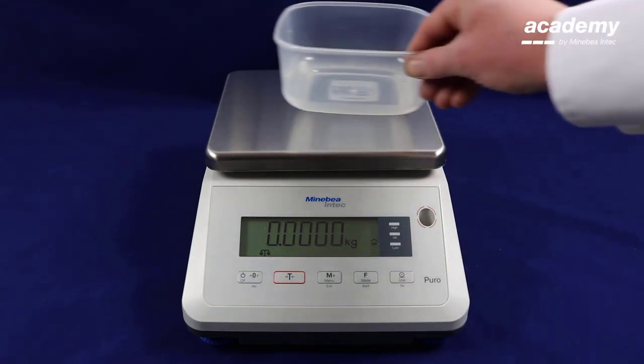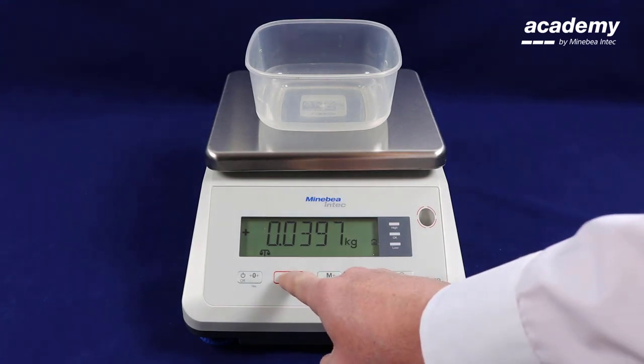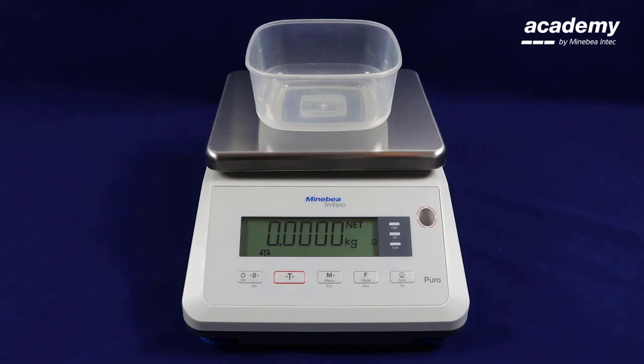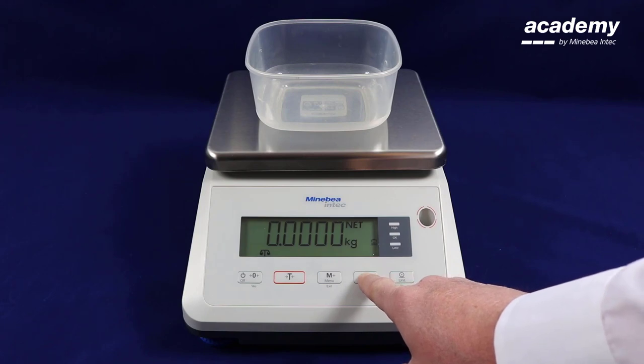To start the application, put a container onto the weigh pan and press the tare key. Press and hold the function key until you see 'count' appear on the screen. When count is displayed, release the key.